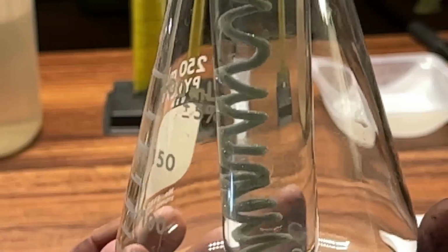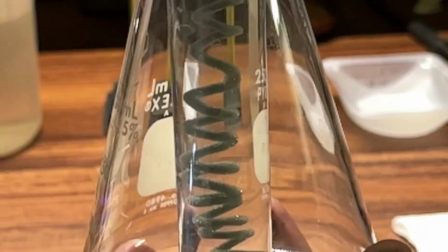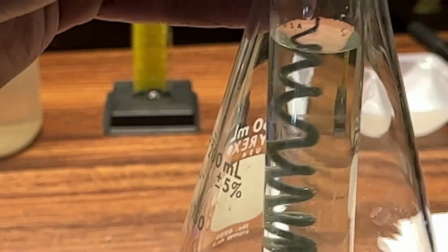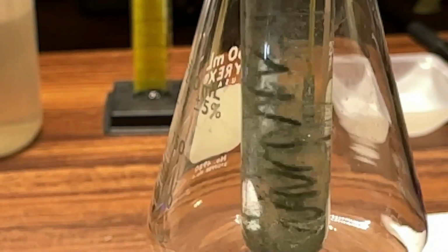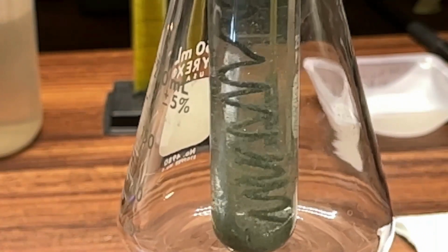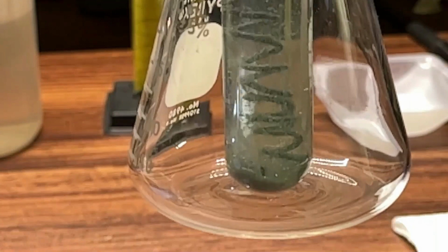Really fast reaction. Now, like I say in the procedure, this will take 25 minutes to react. So check this out. Look. I can shake the coil. All that silver falls off. All the silver falls off the copper coil and settles to the bottom, right?